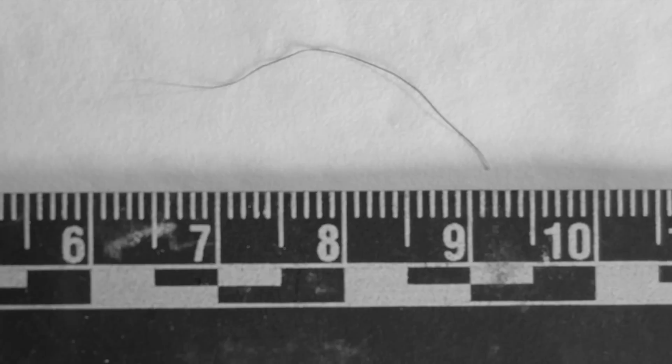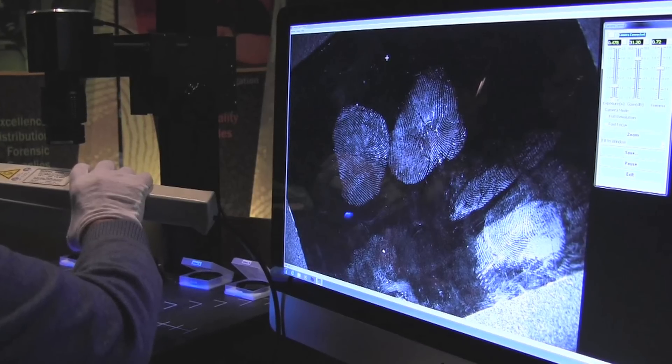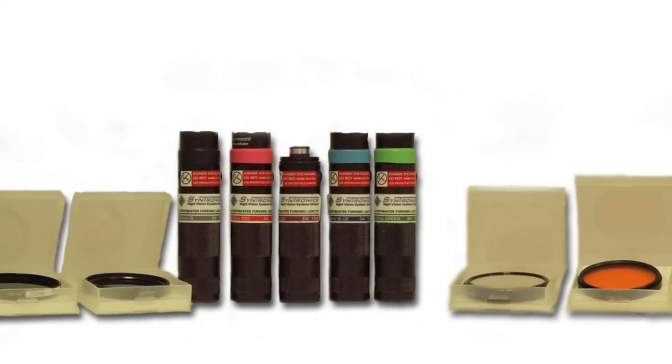documents, body fluids, hair, fibers, and other forensic evidence in real time over a broad spectrum — from UV to visible to IR — using a variety of light sources and filters.